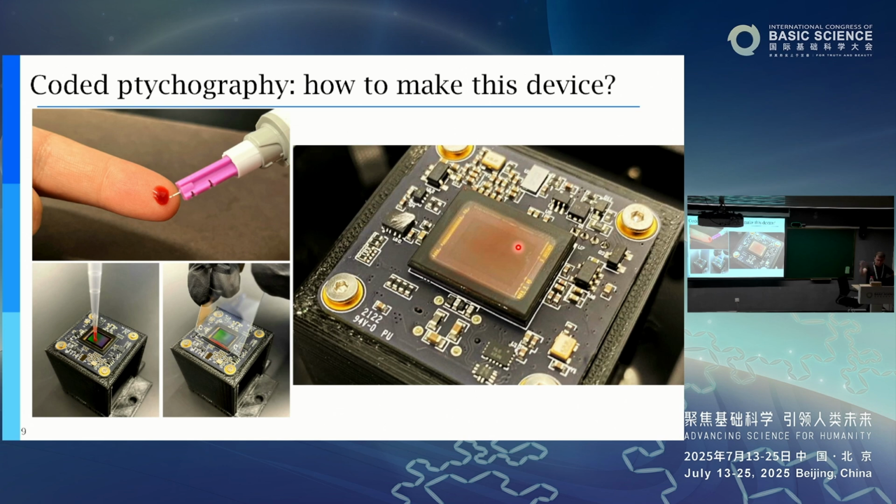And with that, we can have many different benefits. One immediate benefit is that you can make this layer as large as you want. You just smear the blood onto, for example, a letter-size glass window. So you have a huge lens compared to the conventional optical lens.